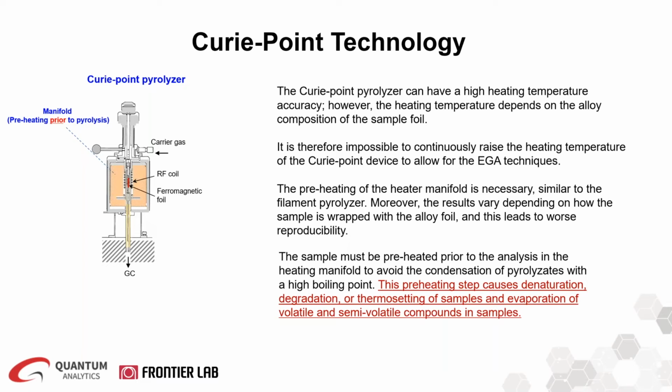Also, as the sample is exposed to heat prior to the analysis in a heating manifold, degradation and thermosetting of the sample happens before starting the analysis, which results in evaporation of volatiles and semi-volatile compounds prior to your analysis.